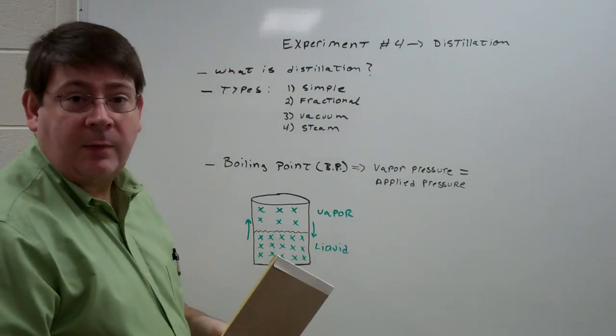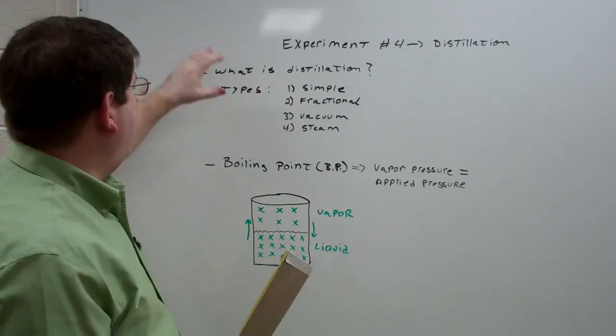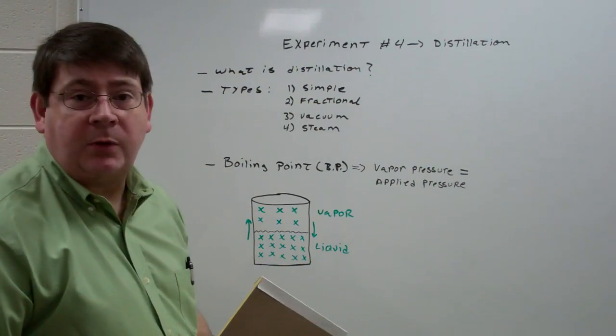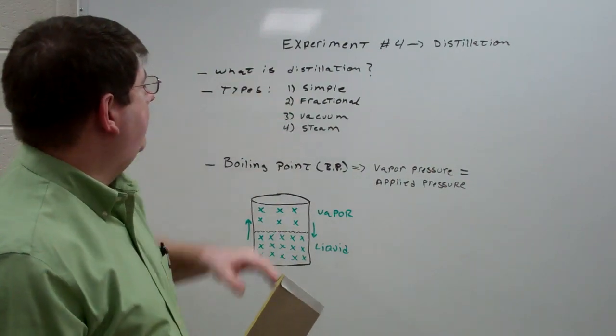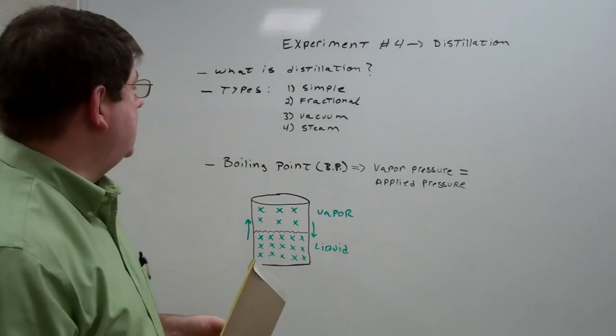So today we're going to be talking about experiment four, which is the distillation experiment. And the first thing that we need to cover is what is actually a distillation. Technically, a distillation is the purification of organic liquid mixtures, basically. It allows us to purify liquids very easily by using boiling and condensation processes.